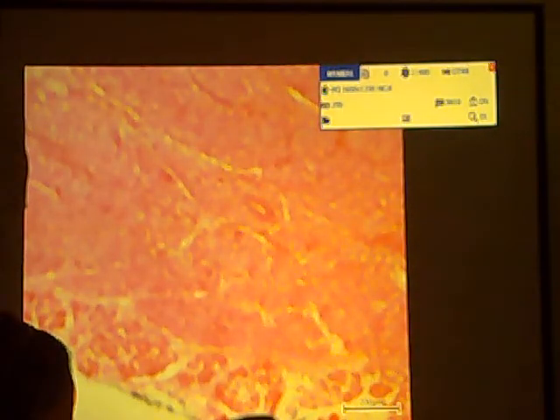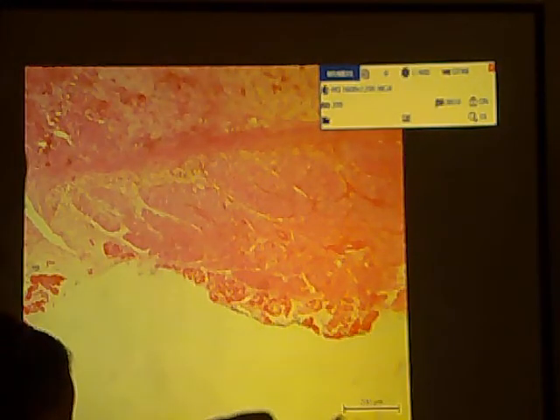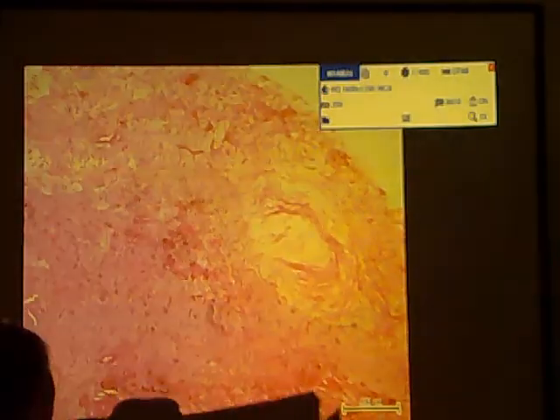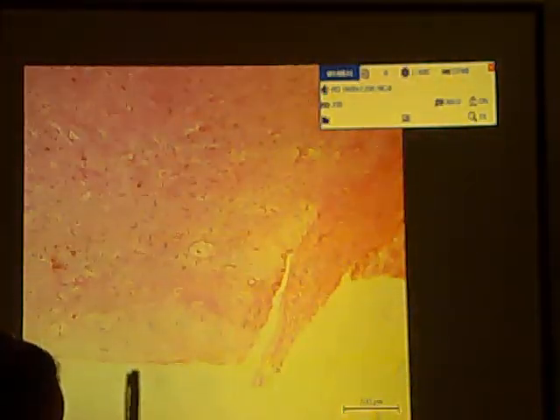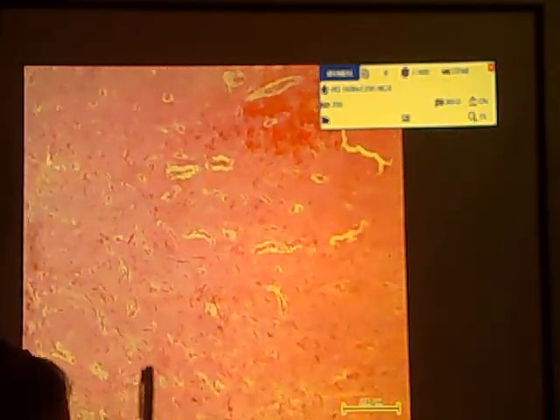I will make it easy for you, so I hope you would get a perfect score on the practical exam for this topic, because it's only a small thing, just the side question. The basic ones. What is this? Good. Galing.